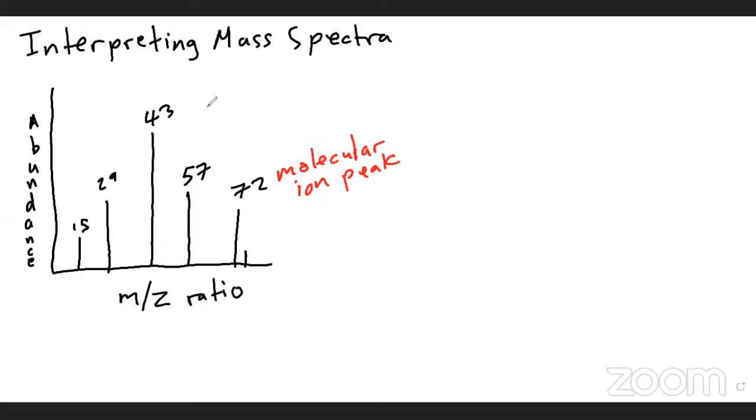All right. The tallest peak now, which is this one here. The tallest peak, we refer to it as the base peak. And the tallest peak is your most stable fragment. So the base peak is the most stable fragment.